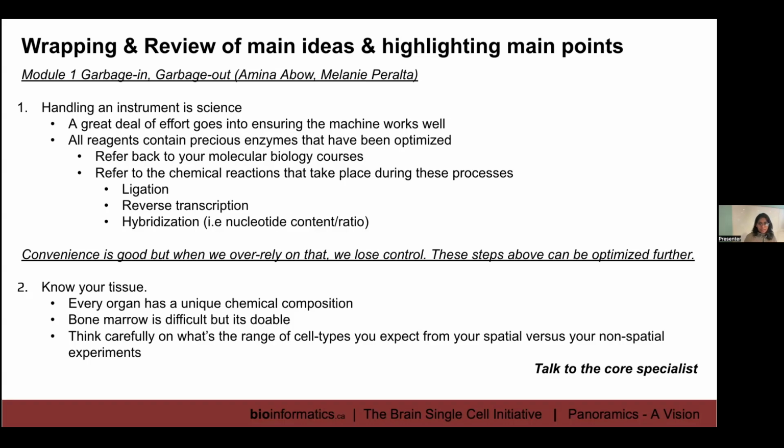The reason why I say this is because it's also important to read papers out there where they are dismantling all these packages and fine tuning, playing around with the reagents. There are labs where they will take the kit and repurpose it. All that can be done. If you need to improve your reactions, it can be done, but it just means that you have to do the job. It doesn't mean that if it's packaged, it's the end all for all our analysis.